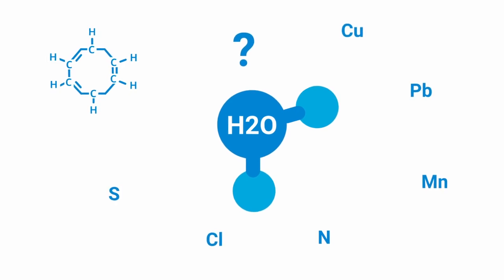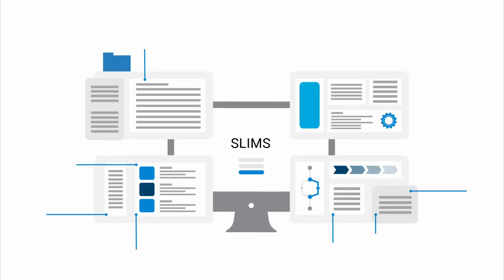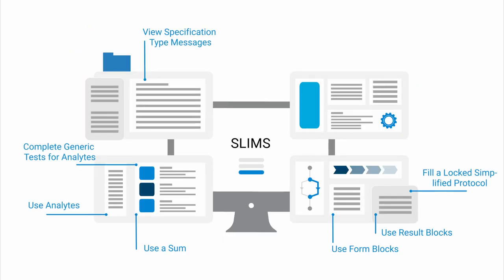Well, let's see how it works. The analytical workflow for this demo shows how to use analytes, use result blocks, use specification type messages, use form blocks, fill a locked simplified protocol, complete generic tests for analytes, and use a sum.